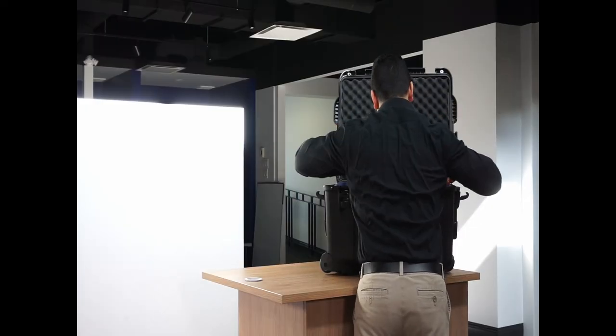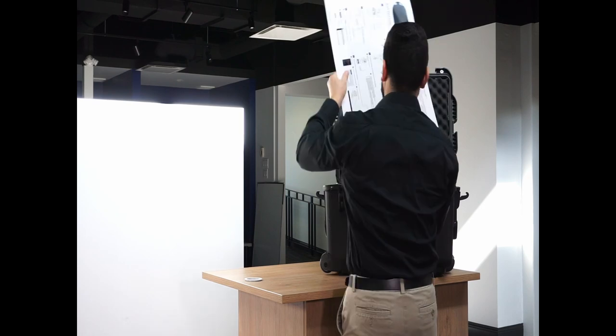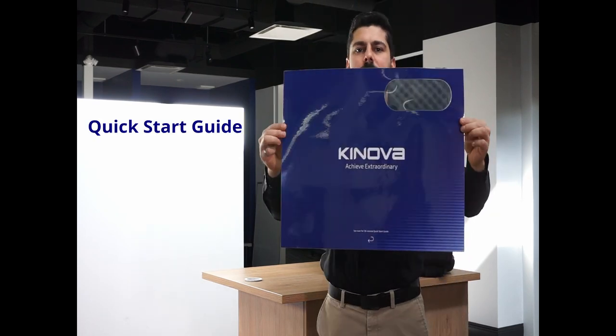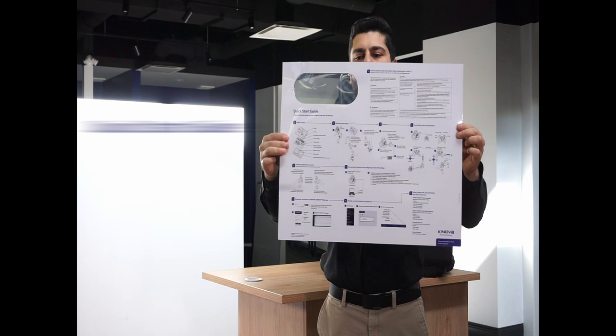When you open the box, the first thing you will find is the Quick Start Guide. This guide sums up all the information I will give you today.